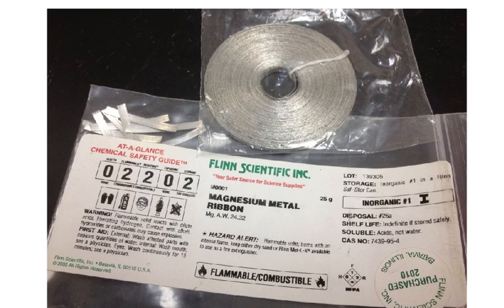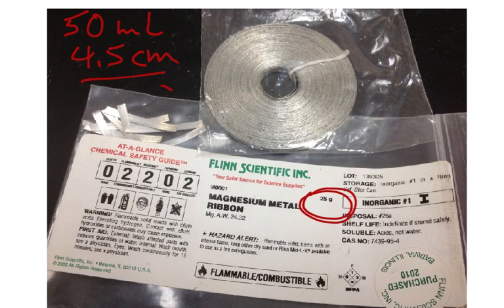First off is the idea that we're not going to be using a mole of magnesium. A mole of magnesium would be about 24.3 grams. And so, you can see that a whole roll of this is 25 grams, a little bit more than a mole. We're only going to use enough because all we can measure is about 50 milliliters. So we are going to try to use about 4.5 centimeters, or maybe a little bit less, of magnesium ribbon.